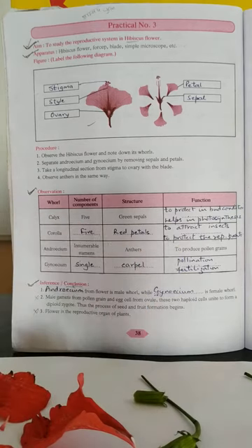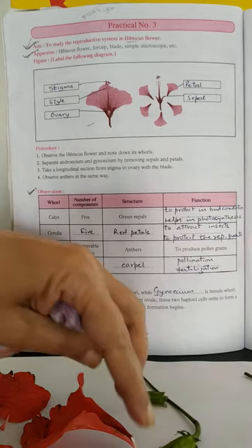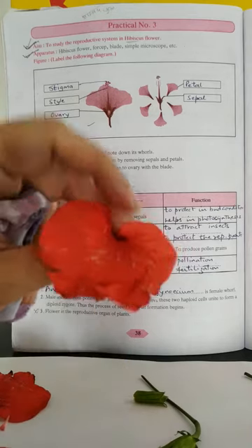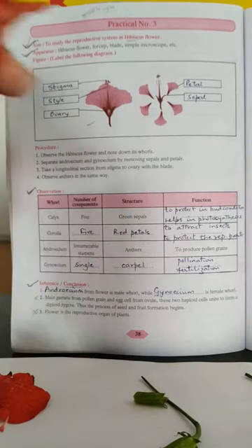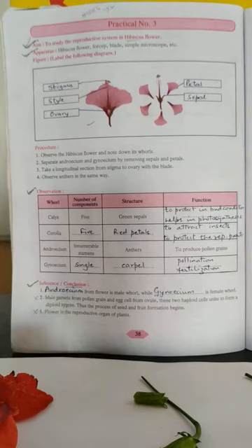The inner to that is the second whorl, which is corolla. It is colorful. The colorful single unit is called as the petal. Then comes the main important reproductive parts of the hibiscus flower. They are two.